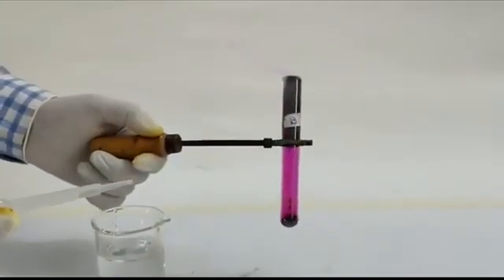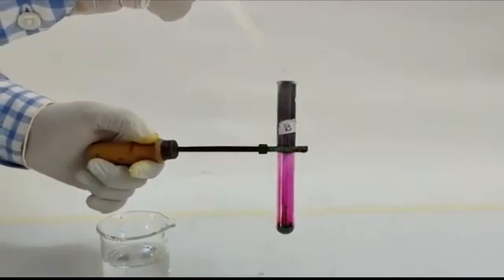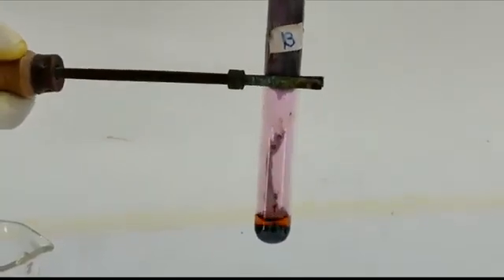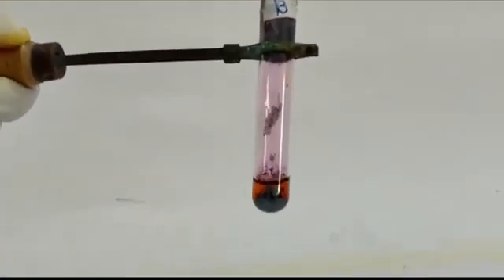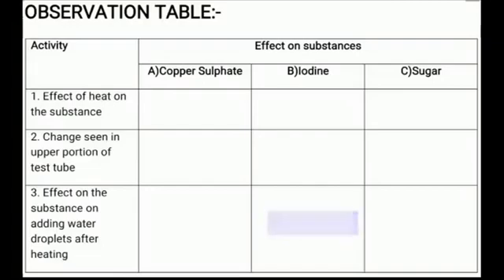Let's add a few drops of water to this test tube B and observe the change, and then we will note it down in the table.